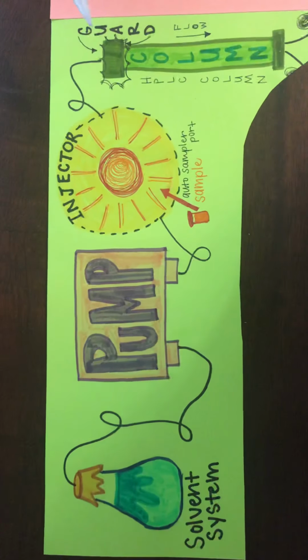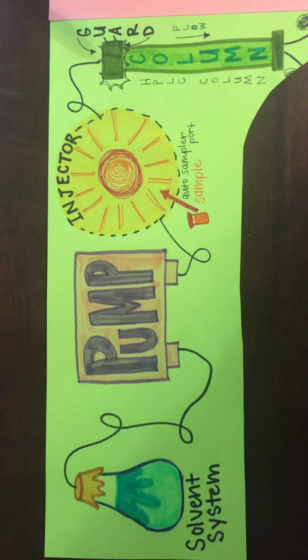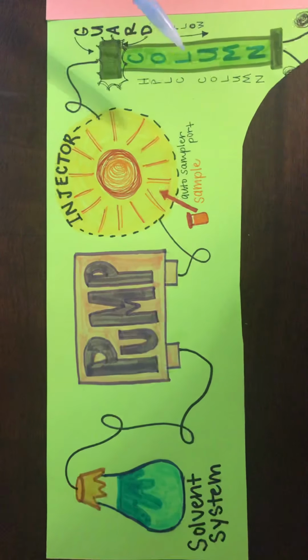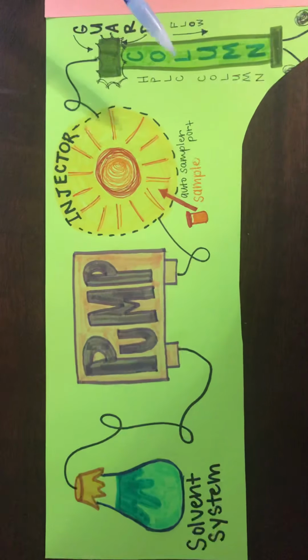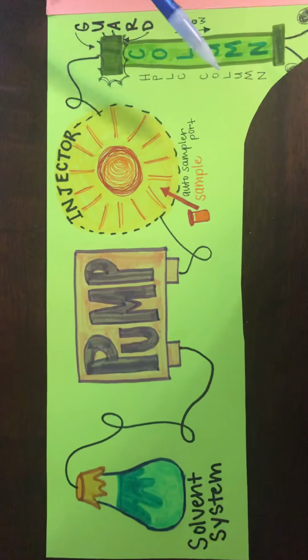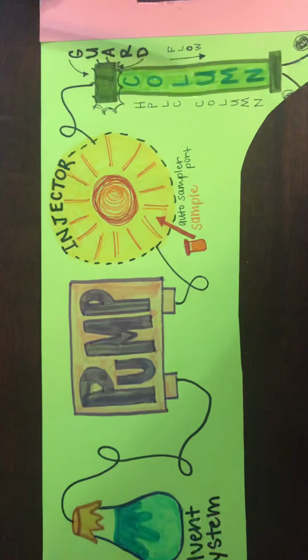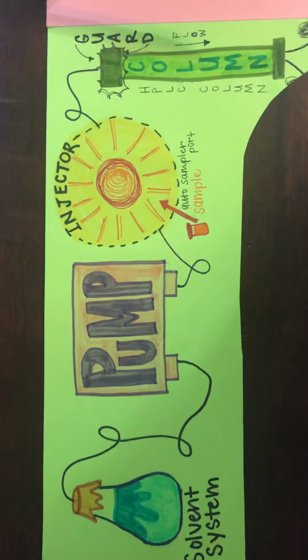A difference in this with the GC is that the GC heats our samples into gas phase, and we don't want to do that with these large and complex molecules because of their complexity. They are not stable at higher temps. That's why we leave them in their liquid phase.